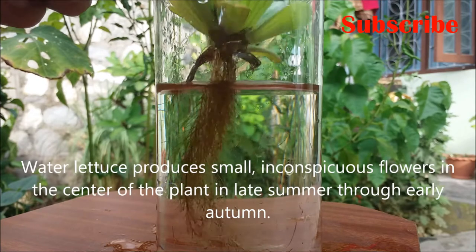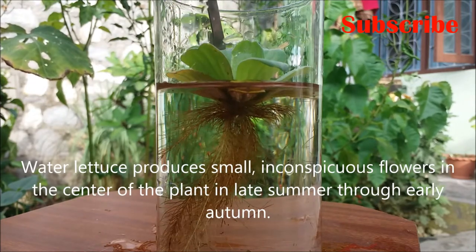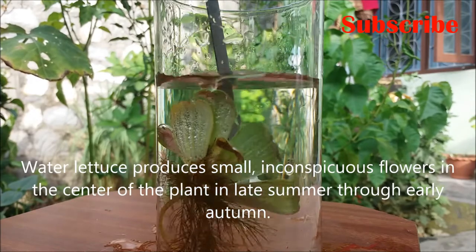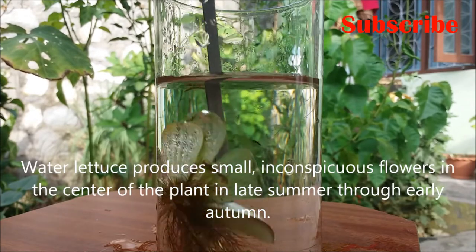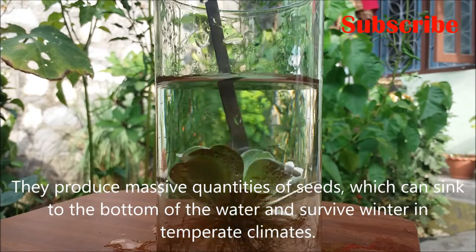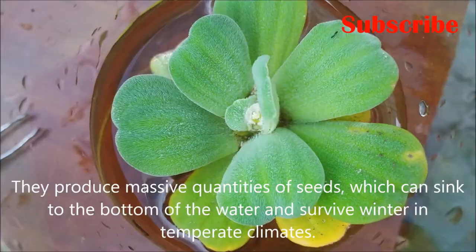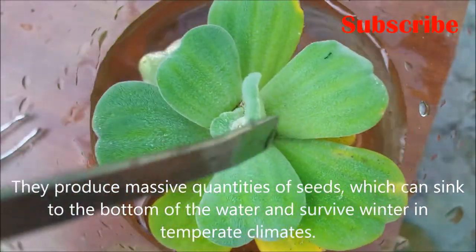Water lettuce produces small inconspicuous flowers in the center of the plant in late summer through early autumn. They produce massive quantities of seeds which can sink to the bottom of the water and survive winter in temperate climates.